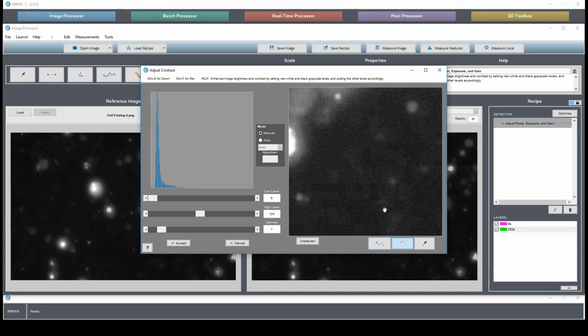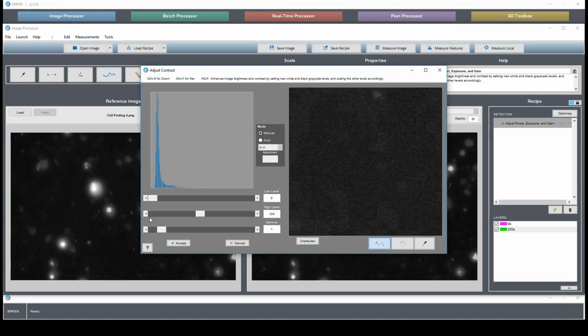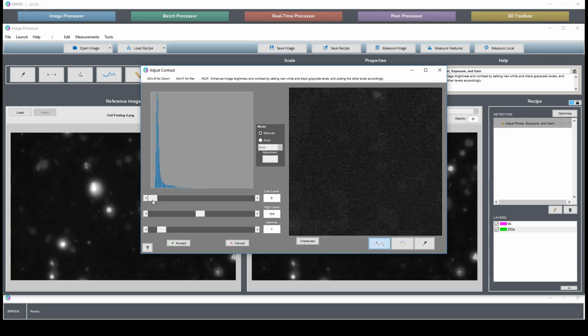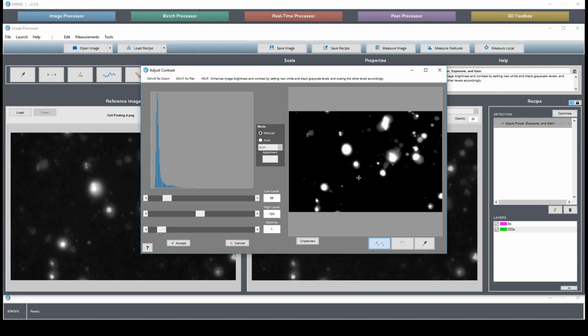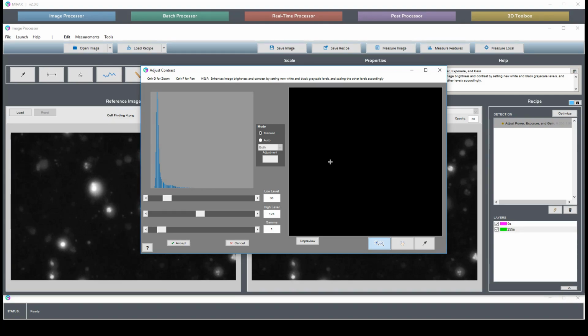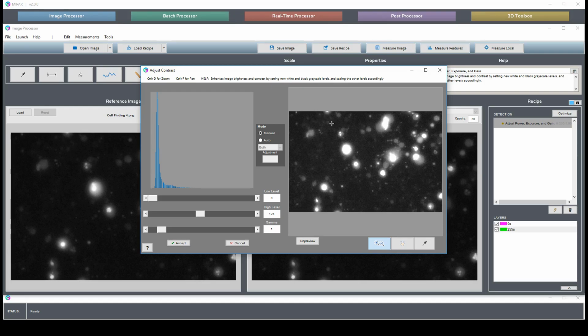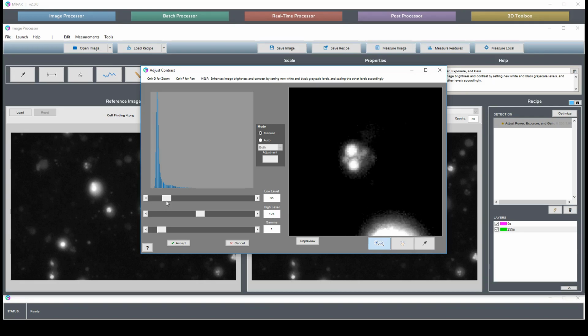And you can do a similar thing to the background here. As we turn up the gain or turn down the gain or the exposure or the power, you lose the ability to see that background. Now this might seem like a good thing, but it's really not, because this background contains valuable information. It contains information about the noise that's in the image, and if you make the wrong choice, you could end up accidentally cutting off the sizes of your features.